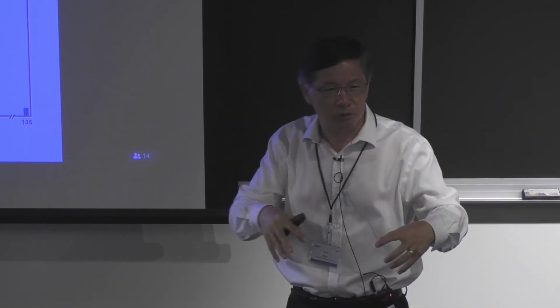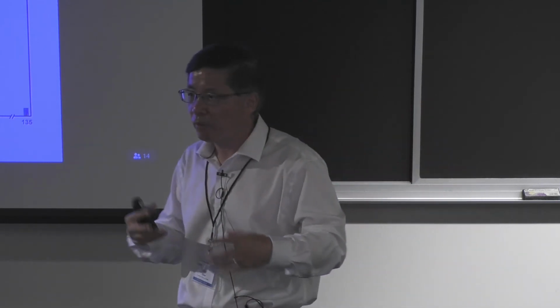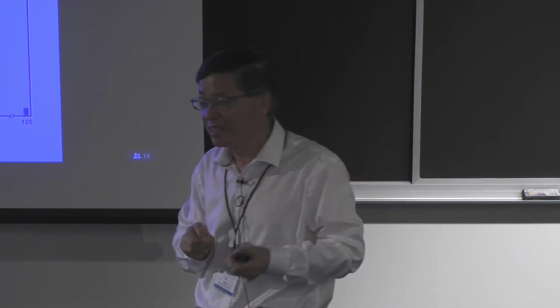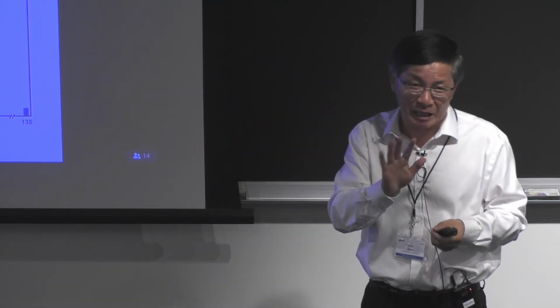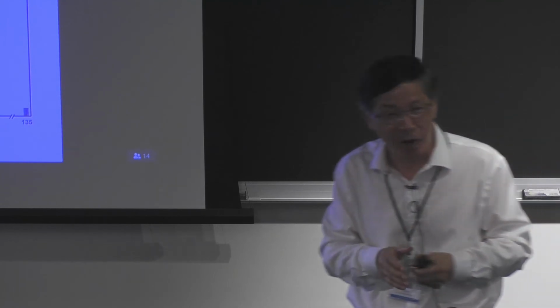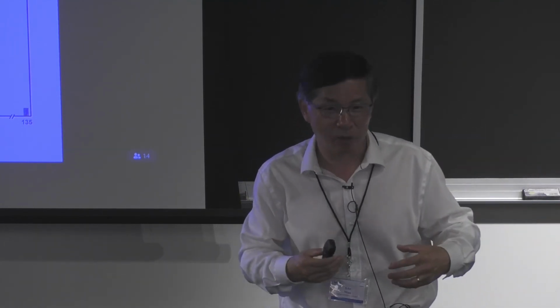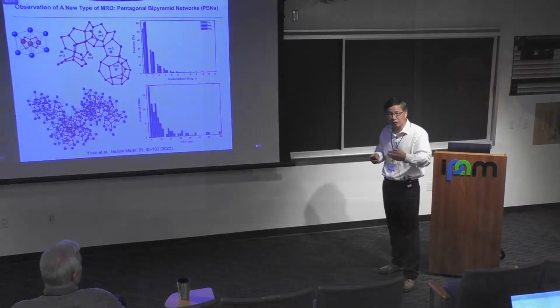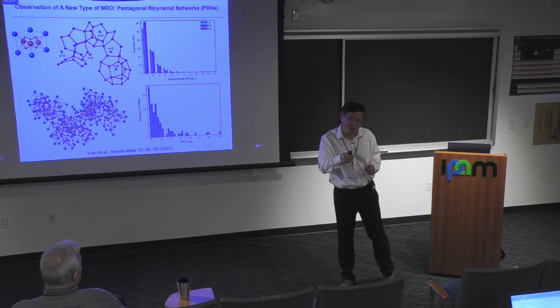And then he poured in some glue, so all these balls glued together. And he asked the poor graduate student to remove one at a time and map out the 3D positions. And he actually published a few Nature papers about the packing of these 3D balls, trying to understand liquid. So there are a few classical papers. But now we can really look at the atoms. We can get the coordinates.